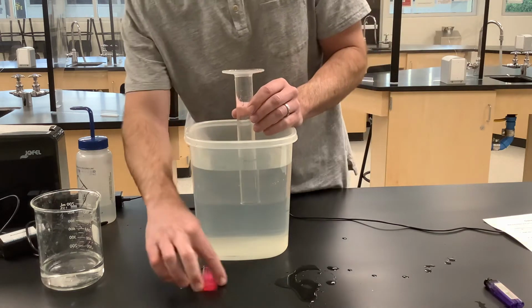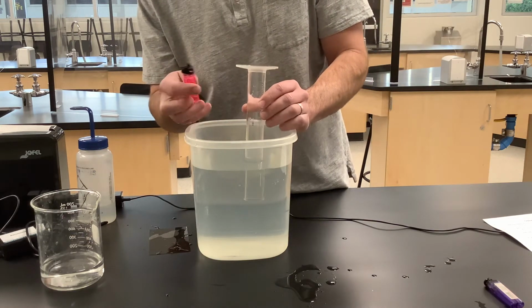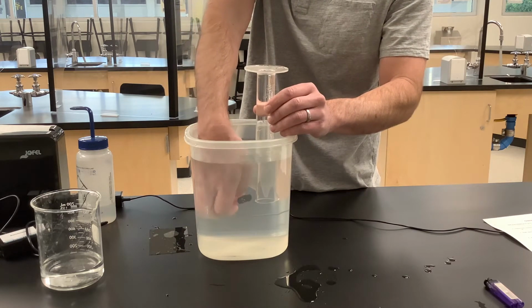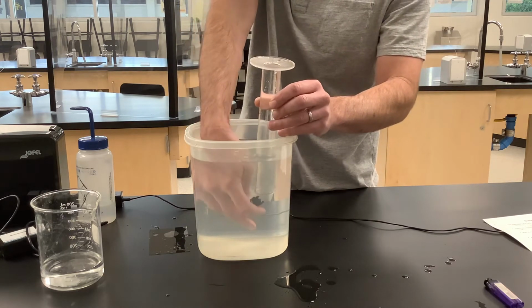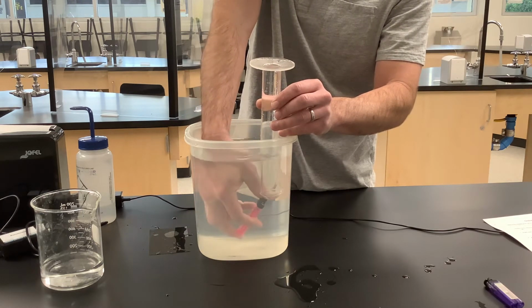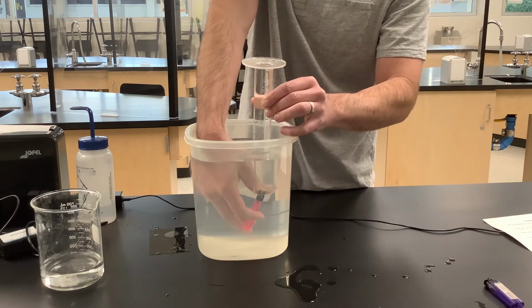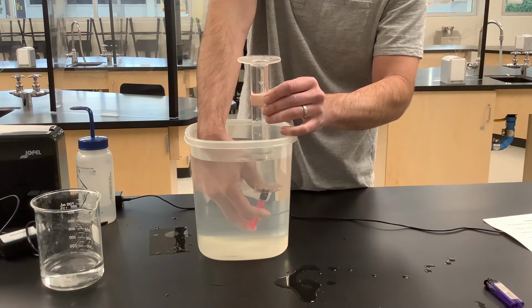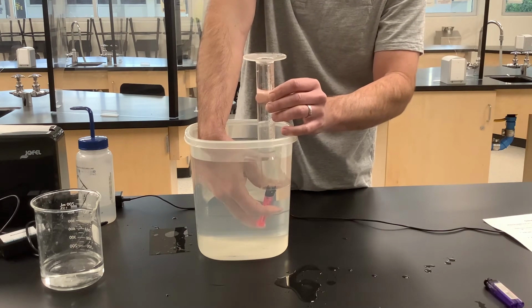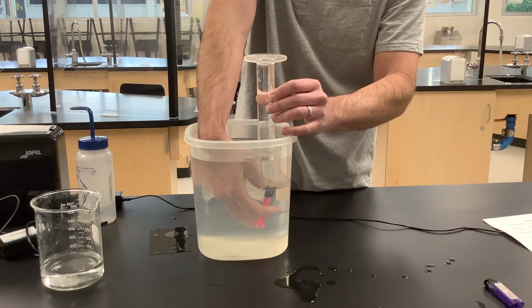So what we'll do is take the lighter and submerge it in here, and start filling the cylinder with butane. We're going to bubble it through, if I can get my fat hands underneath this. We start the bubbles and we see that the bubbles begin, and then it just becomes patience. We just need patience here.